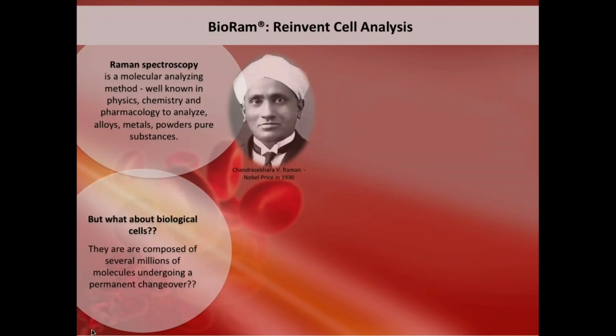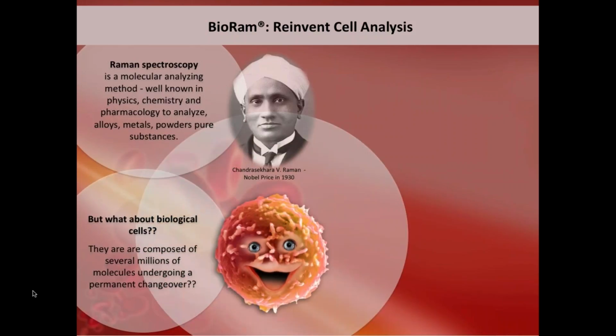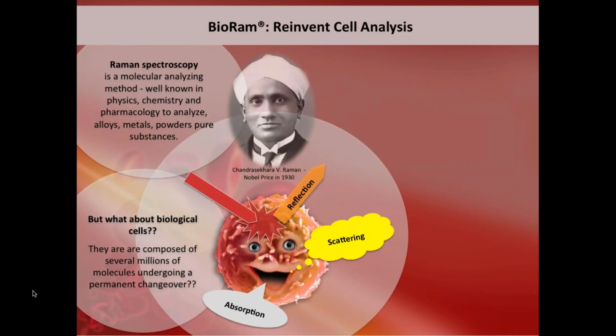Everything fine. Okay. The question was, why can we still look into our cells when we have such a high amount of molecules that are undergoing a permanent changeover? And this was what everybody was really wondering, that it works, that we can use the Raman, which is focused to about a spot size of a micron towards the cells, and measure the information that we get from the interior of the cells, not only, as usual, from the surface.